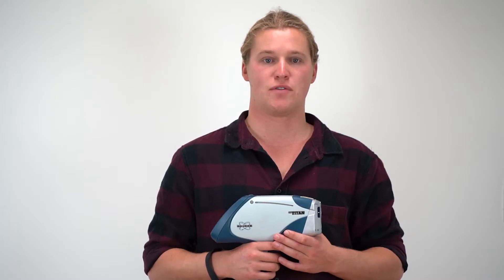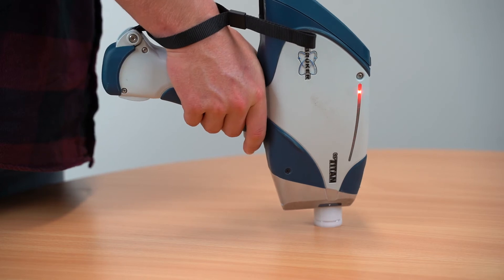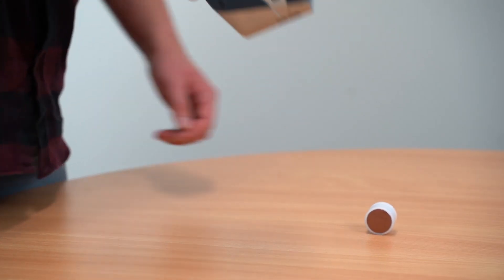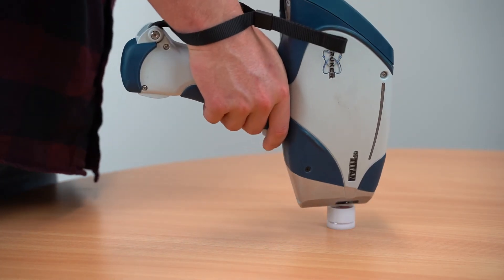If your hand moves and comes away from the sample this will impact your results. If the instrument slips off the cup, press the trigger immediately and end the scan. Reset and take the analysis again.